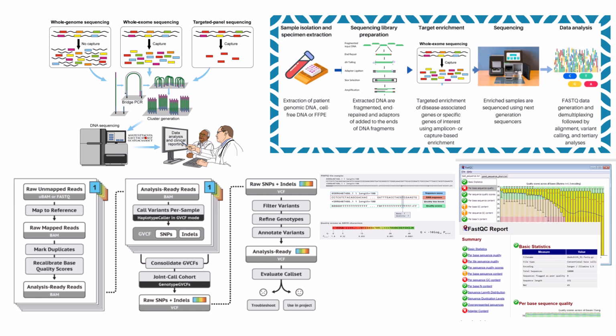There will be some false positives, positions flagged as variants due to subtle sequencing or alignment errors, and also lots of common benign variants that aren't related to the patient's condition, which is why Phase 5 is absolutely critical. Filtering variants, removing the noise. The whole goal here is to take that raw, noisy list and filter it down. Try to keep only the high-confidence, potentially meaningful changes.